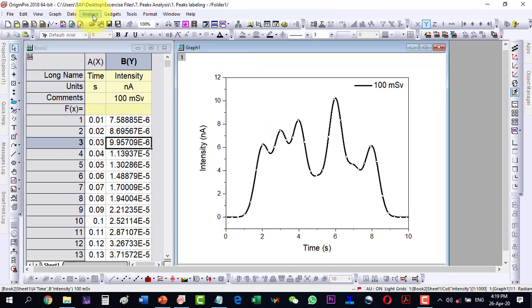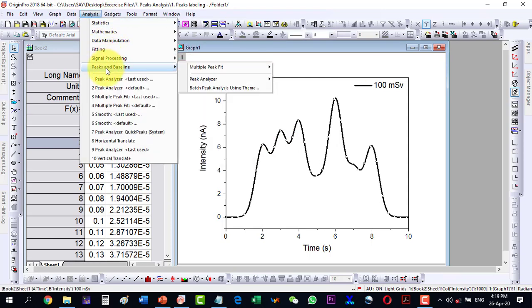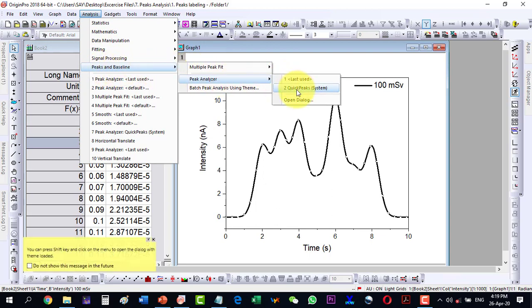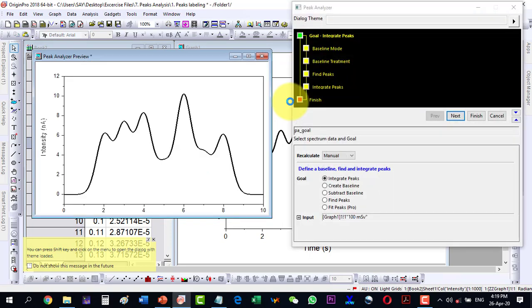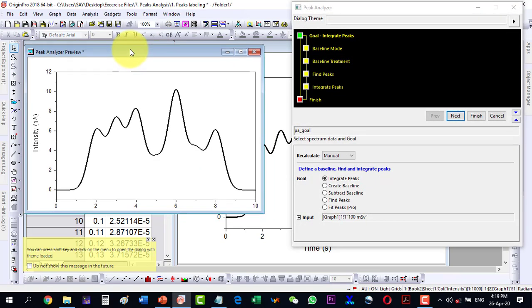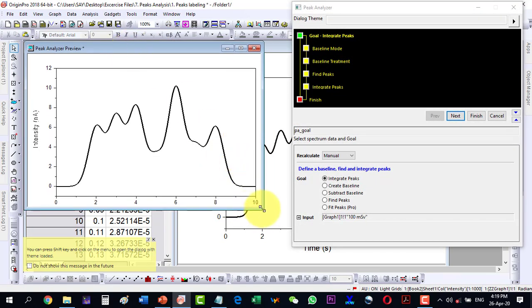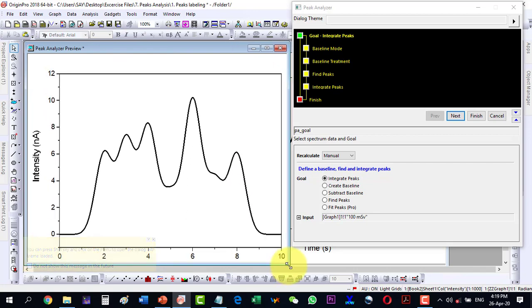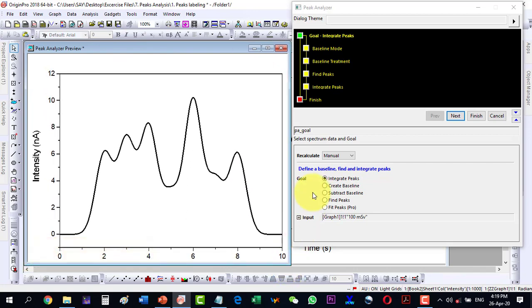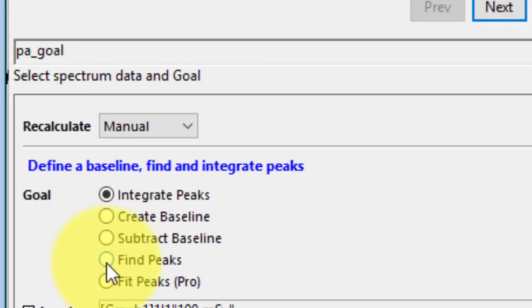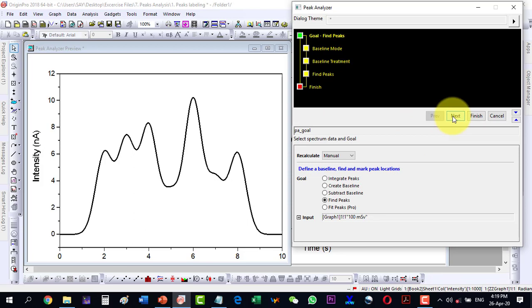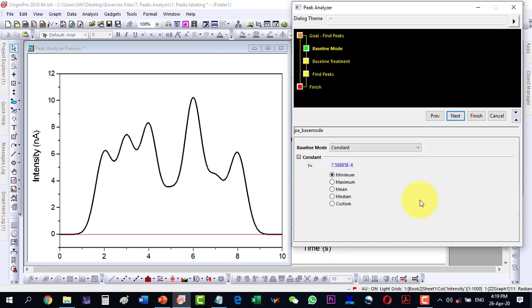To do it automatically, select the plot and go to Analysis, then Peaks and Baseline, then Peak Analyzer, and open the dialog. It will show us a preview of the plot, so let's maximize this one.